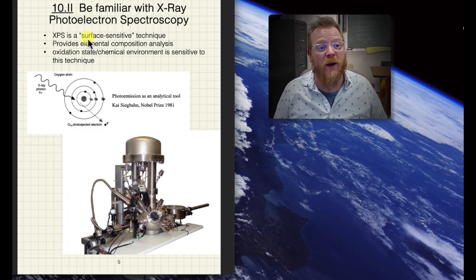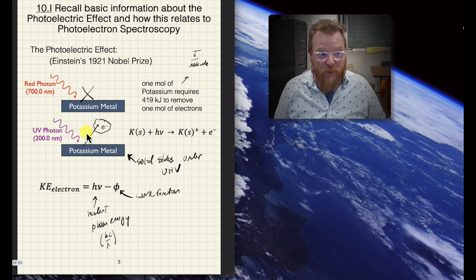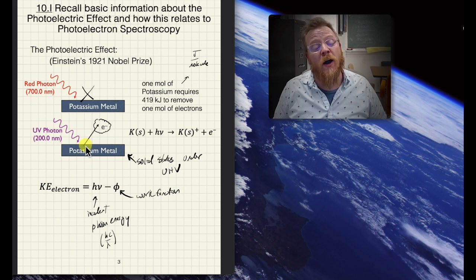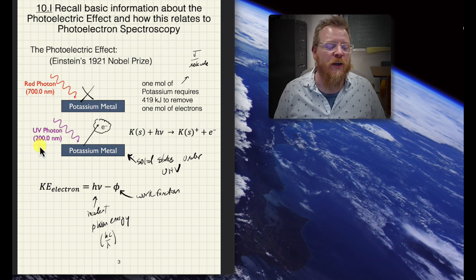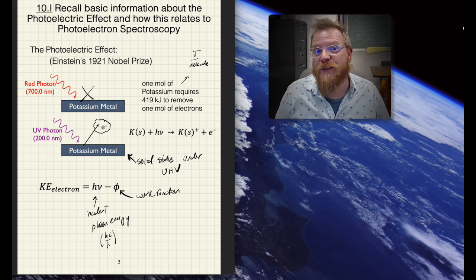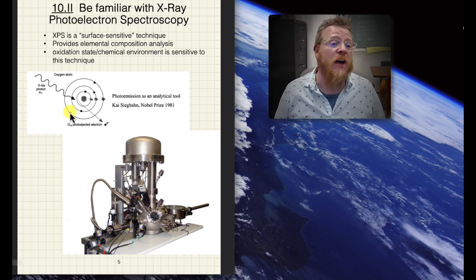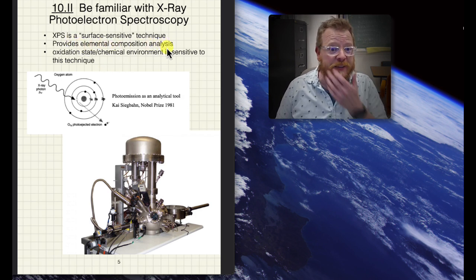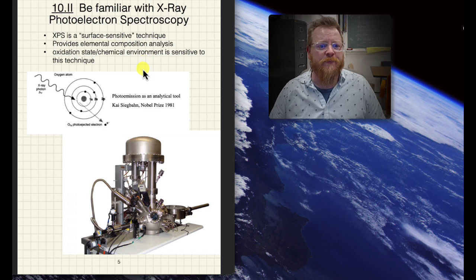So XPS, or as I said, X-ray photoelectron spectroscopy, is a surface-sensitive technique. Just like was shown in this photoelectric effect picture, where we're shining light at the surface of a material, only electrons will emanate from the very surface of that material. So this is a great way to characterize, like, the surface of a catalyst, for example. Or really the surface of any solid that we can get under ultra-high vacuum. So this can provide elemental composition analysis, and we can also get molecular analysis when used correctly.